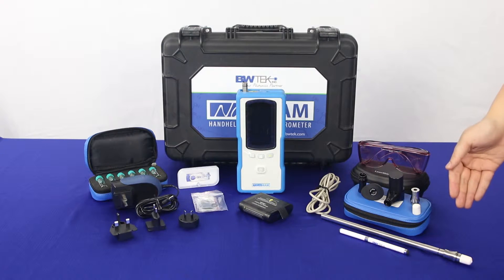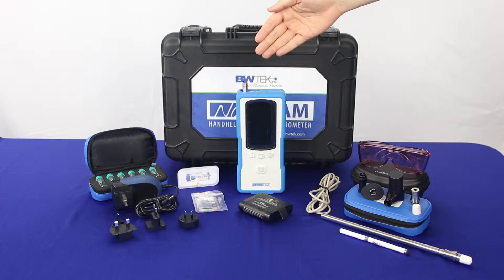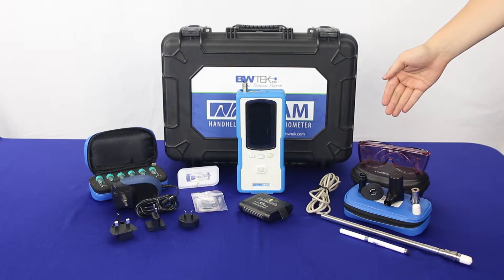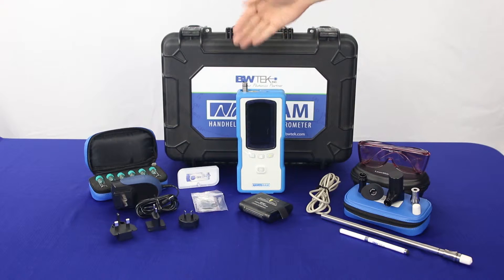There will also be an immersion shaft, a pouch containing six glass vials, a 12-volt charger with multiple adapter heads, a LAN cable, a pair of laser safety goggles, a stylus pen, an o-ring replacement kit, and a USB drive with the NID software.